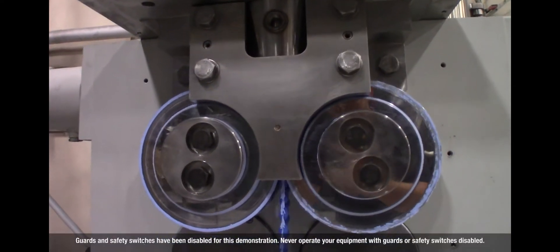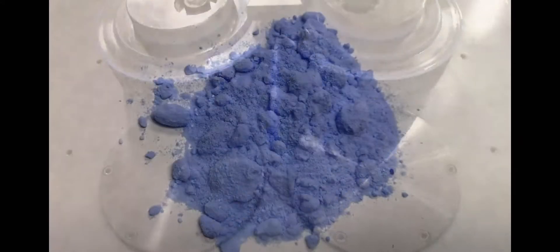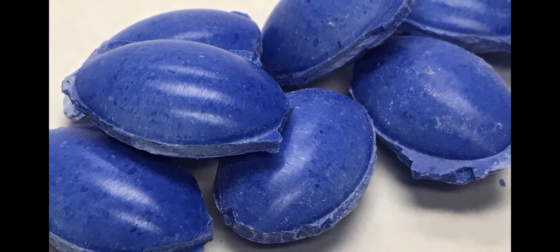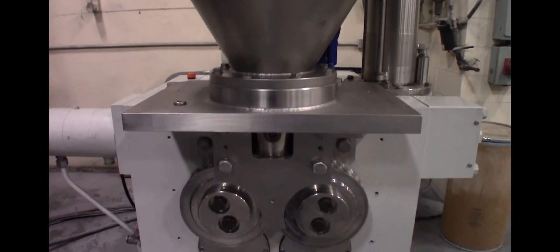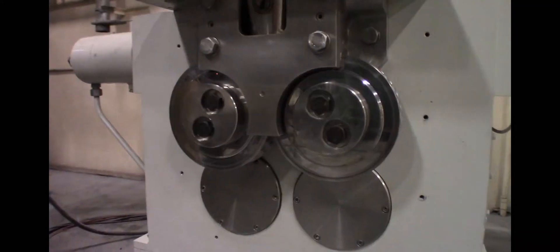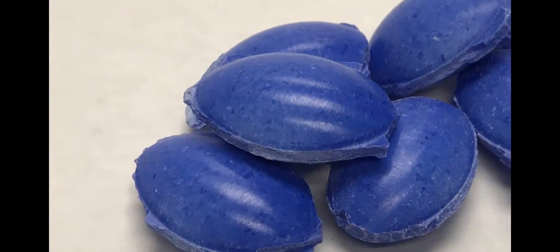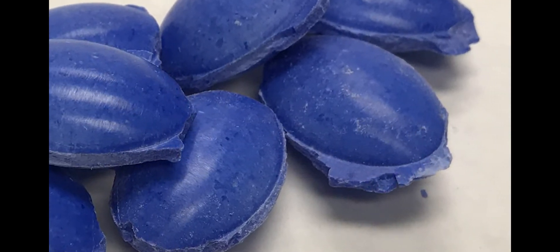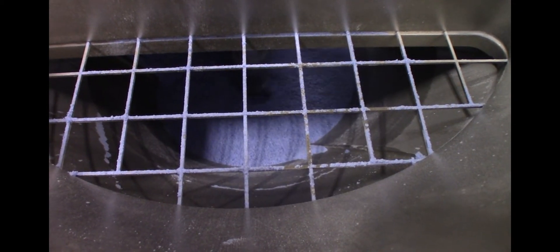The technique uses compression forces to remove entrapped air and mechanically bind fine particles into larger, easy-to-handle material. This video demonstrates how the Hosokawa Alpine CS25 compactor can economically transform dusty, low-density powder into dust-free, high-density briquettes.